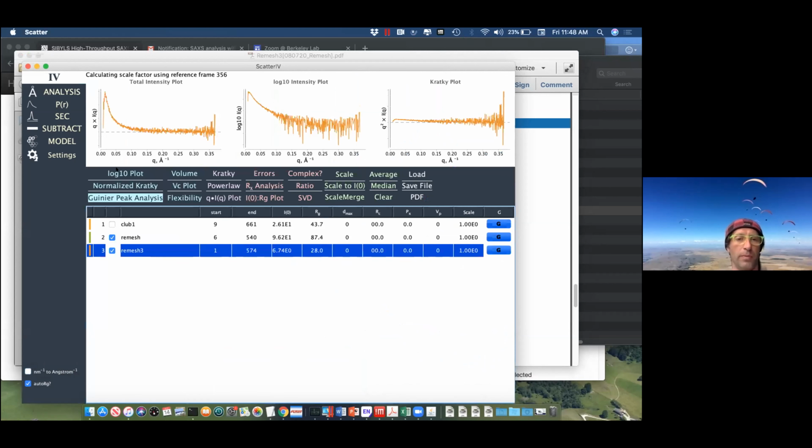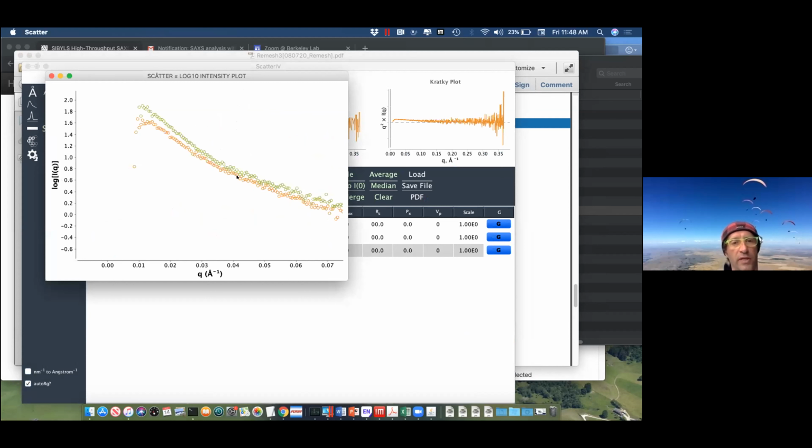And it will be interesting to compare the poorly separated sample with the better separation of the peak. You can just type log here, and you already start to see that the aggregations pull the curves up a little bit. So the large aggregations are really responsible for the high intensity of sample 1, and sample 3 is well behaved.